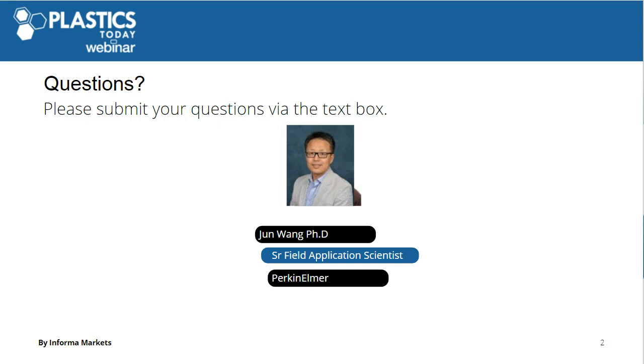For high frequency, there are some techniques, like I mentioned. For example, a free resonance test or an impact tester, like a drop test. You can use those to test the sample and compare that with the TTS model.